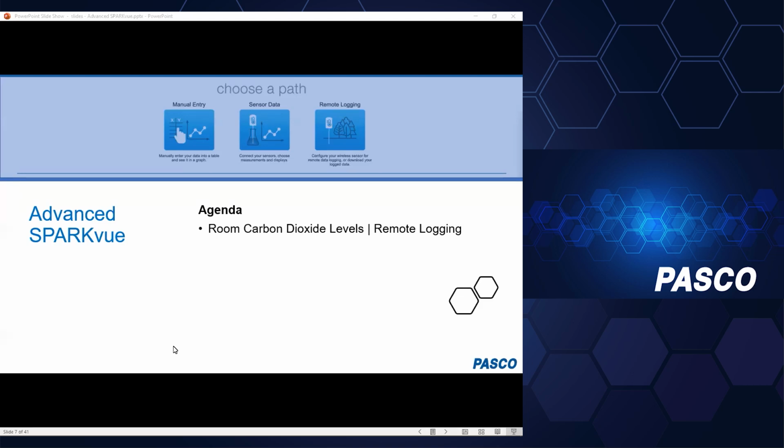I'm using these activities to introduce you to some of the more advanced features of SPARKvue. So we're going to take first a look at the carbon dioxide levels in this room. And this is something I'd like to record over the course of the entire webinar, the entire hour we have together. So I'm going to show you a technique that will allow me to do that without occupying my computer for that entire duration. So we can do some other activities, the second of which is pH of household chemicals.